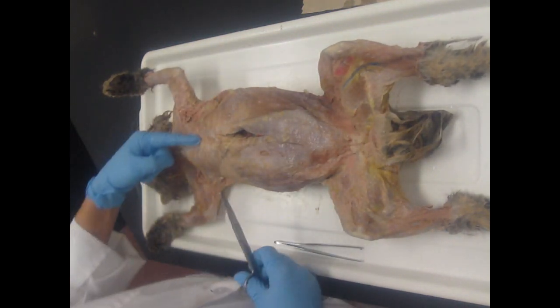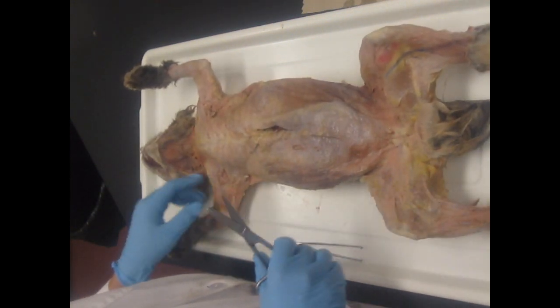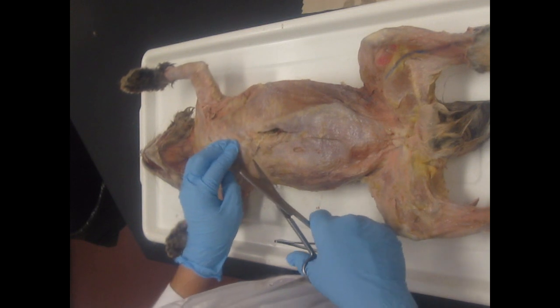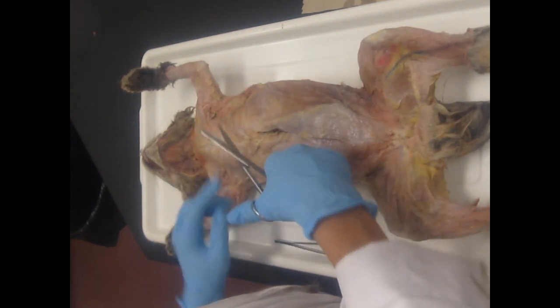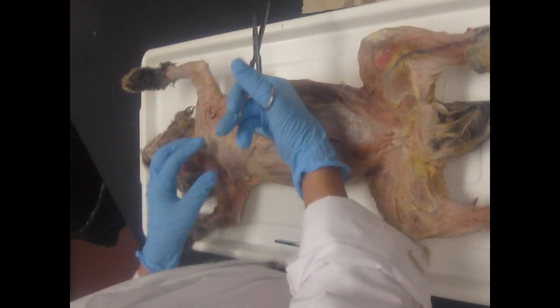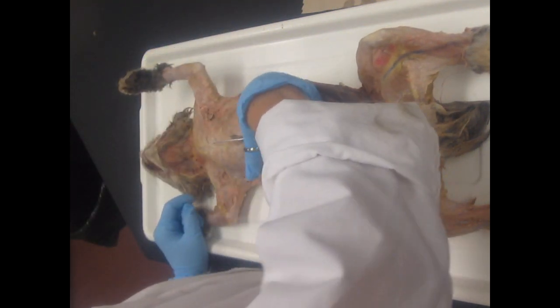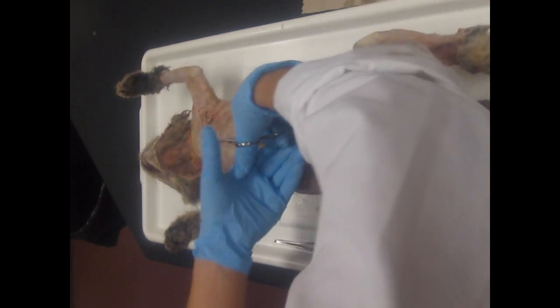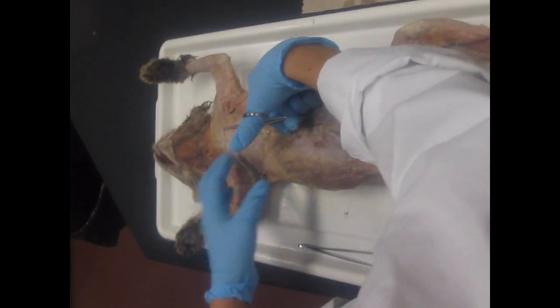Now we're going to go to either side of the sternum to open the thoracic cavity. You don't want to cut through the sternum because that's bone. So go on either side, and it doesn't matter, whichever one's more comfortable for you. Just make sure that you're above the diaphragm. Okay, there's my finger. So as long as I go here or up, we're fine. We're just going to poke and get in between the ribs there. Now, you're going to lift up on the cavity wall, and we're cutting through costal cartilage here, which is a lot easier to cut through than bone.